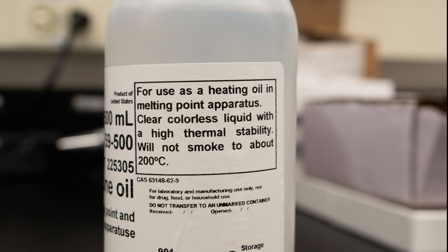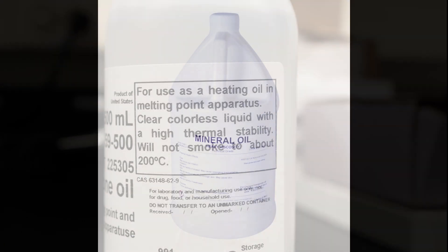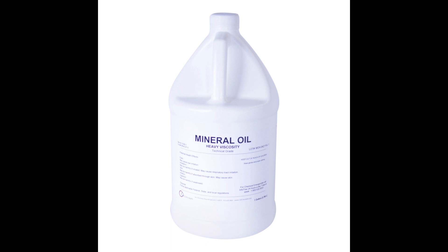Usually the silicone oil used for heating baths will be stable up to 170 to 200 degrees Celsius. A cheaper option is mineral oil, which also has a relatively high smoke point. If you need a higher temperature, sand baths would be a better option.